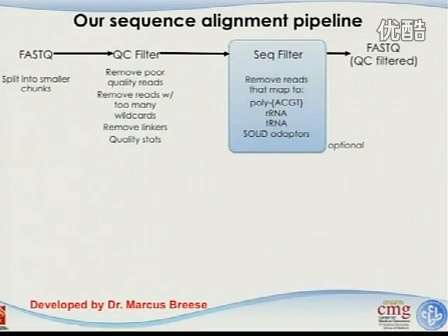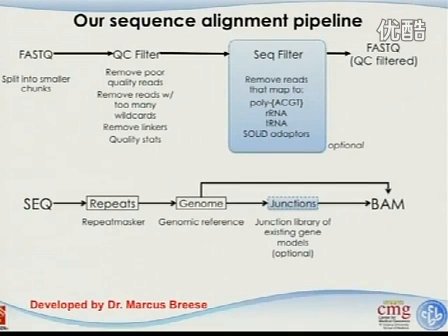You can see that this quality control information can do it, but in the alignment part, what we did is we got a sequence, and we first align to the genome, okay? And then we build a junction library. For every single possible junction, you have an exon here and an exon there, and they don't have to have evidence connecting them together.